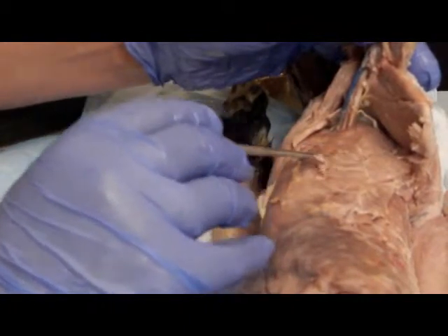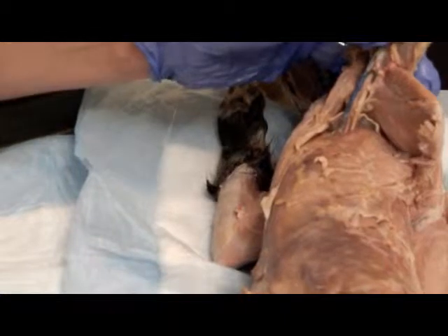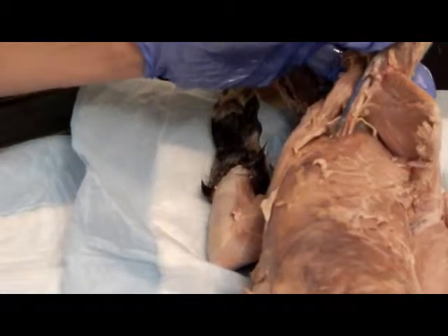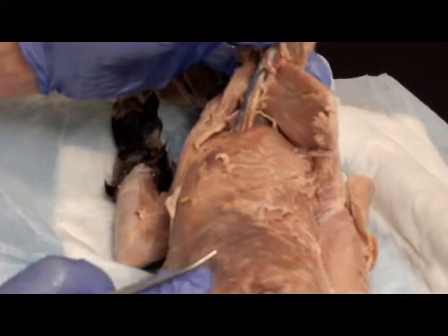These are the serratus ventralis. The origins are the first 9 to 10 ribs. Its insertion is the medial surface of the scapula, and it pulls the scapula forward.